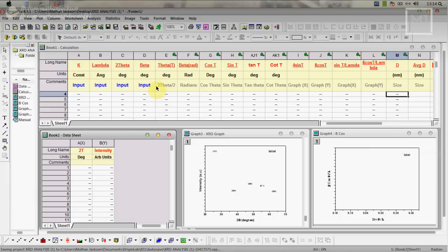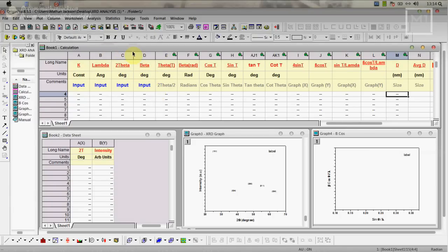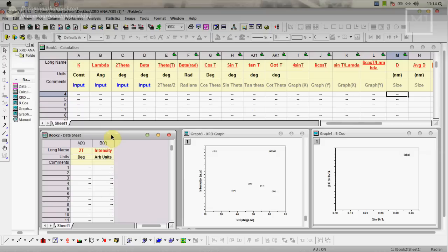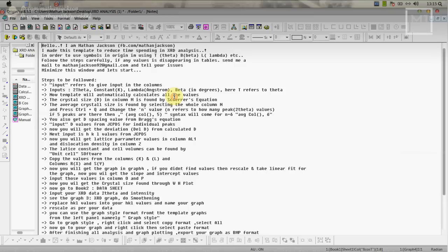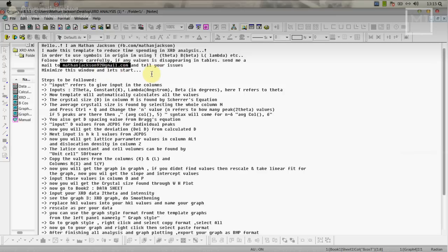Here is your template. In this template, this is the calculation part and this is the input values you are going to give here. The plot will come here and this is the WH plot. This will be done after this calculation. If you get stuck anywhere there is a manual here. If you double click, manual will come, everything is here. If you have any doubts or error messages, just mail here so I'll clarify that.